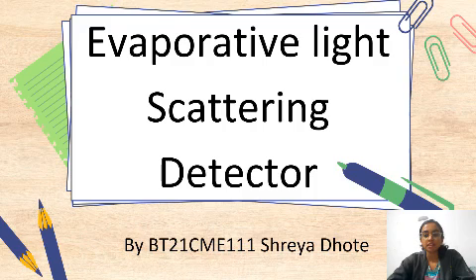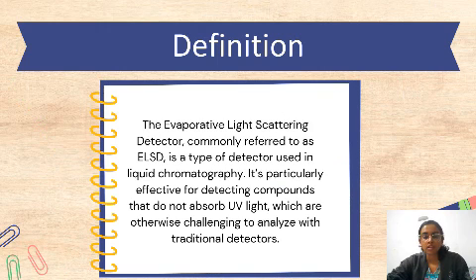Today I will be discussing the Evaporative Light Scattering Detector, which is also called ELSD, a type of detector widely used in liquid chromatography applications, particularly for non-volatile and semi-volatile compounds. Let's start by knowing the definition.